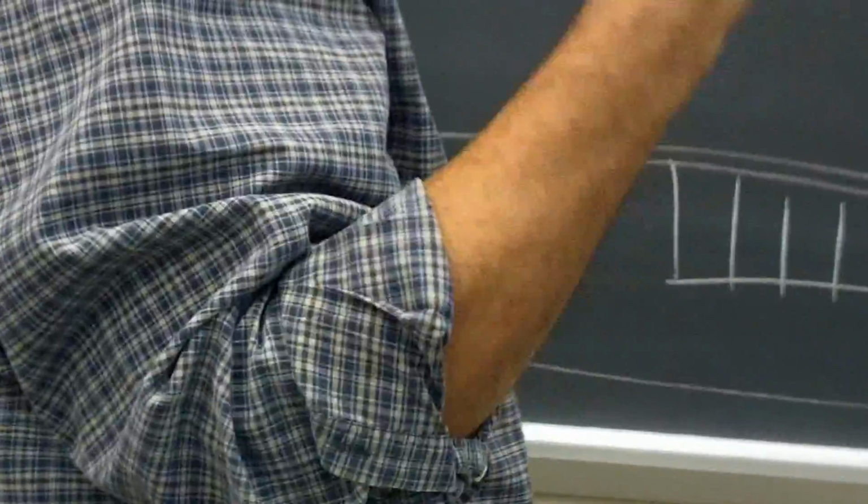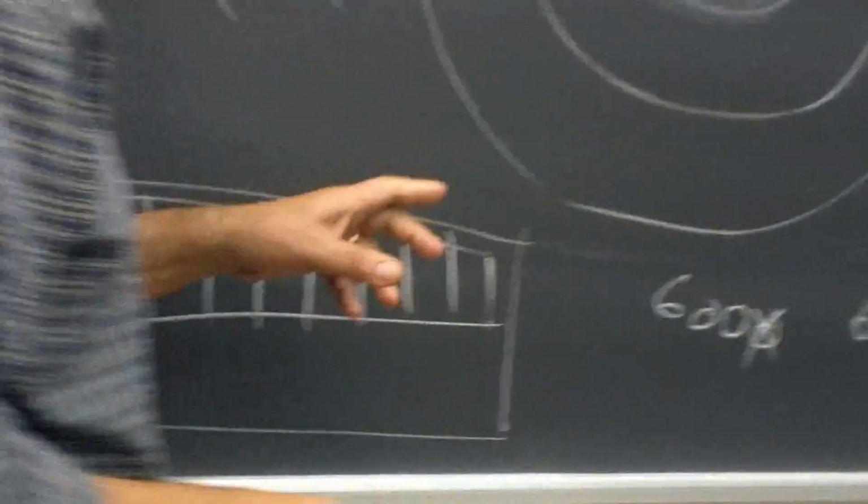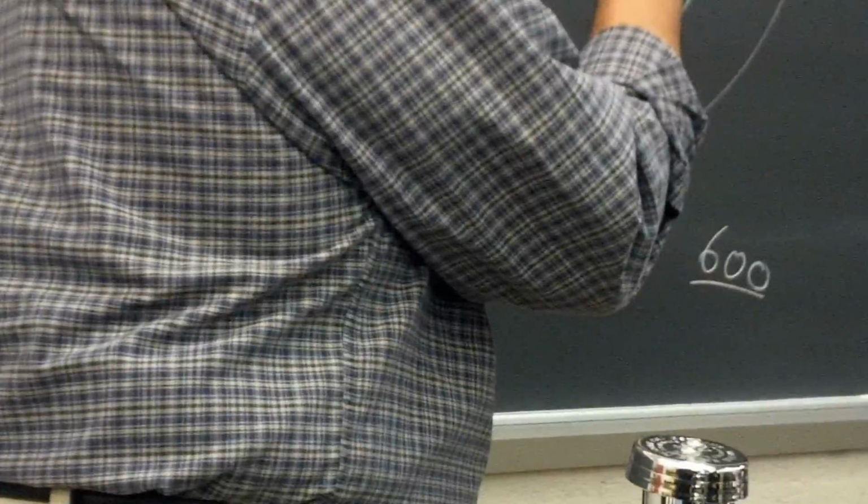Now, the numbers on there, I'm not going to tell you what they are. You're going to look at the numbers and look at them yourself. Some of the numbers are going to say, for example, 6,000, all right? We're not going to take the last zero. We're only going to look at the first three numbers, all right? I don't know which instrument's there, but that same number might in fact be 600 here. Then this is okay. So some of the scales are measured in the European version and some of them in the US version. We're going to take the US version, which is simply 3 digits, right? Got that? So forget about the last number. If you look in there and see a 6,000 or a 5,000, it's 600 or it's 500, right?